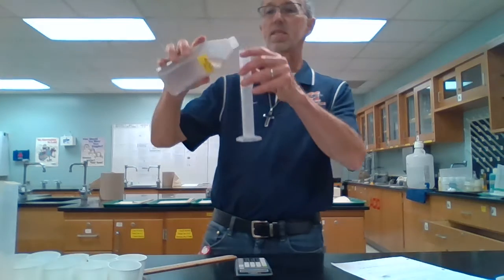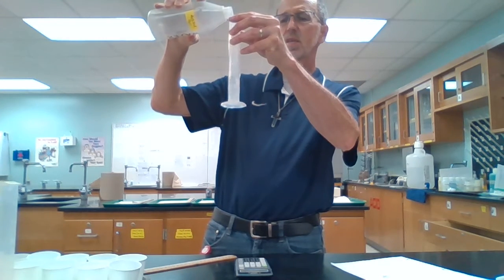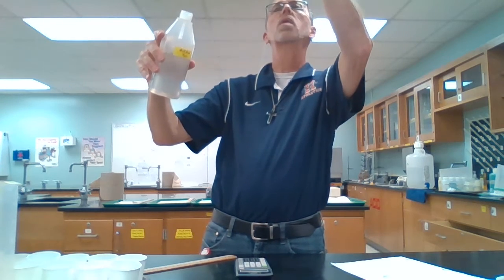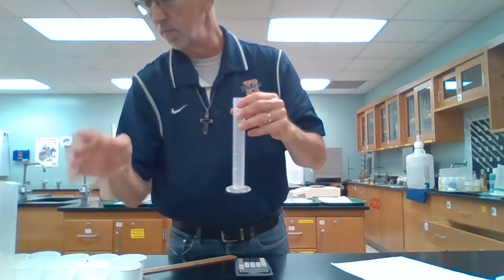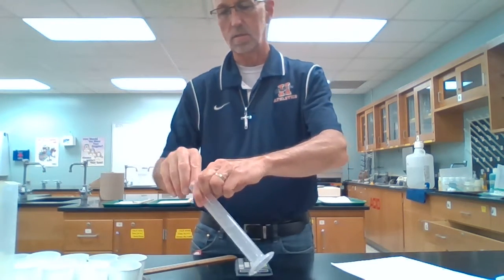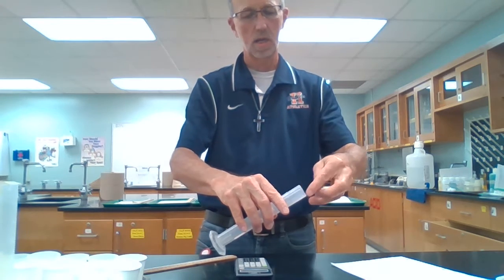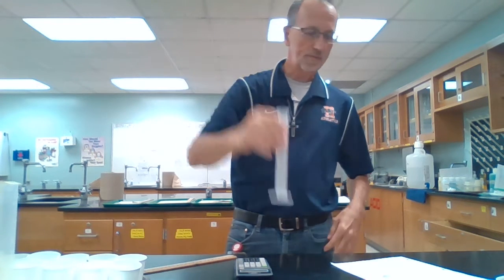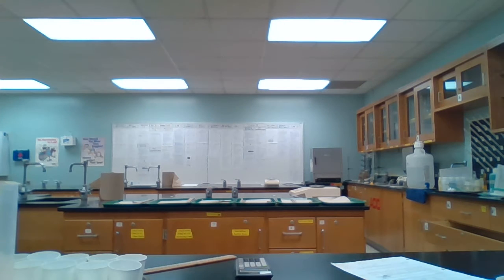And last but not least, number 6. Make a mental note of that volume. Here are the pieces for number 6. Slide those in there. Do a little mental subtraction again. Looks like our volume is 6.5 mLs for number 6.